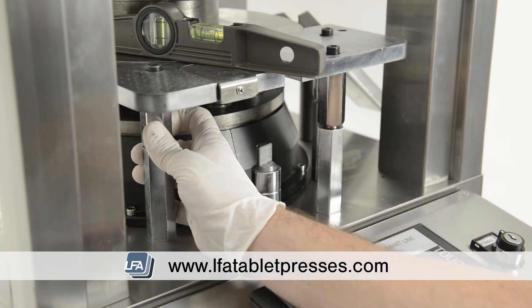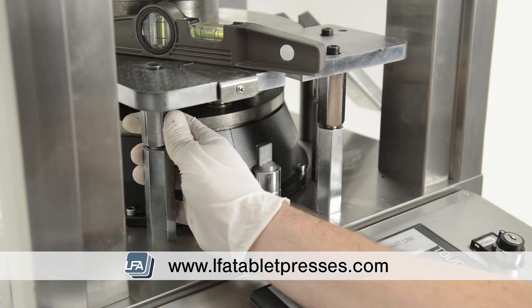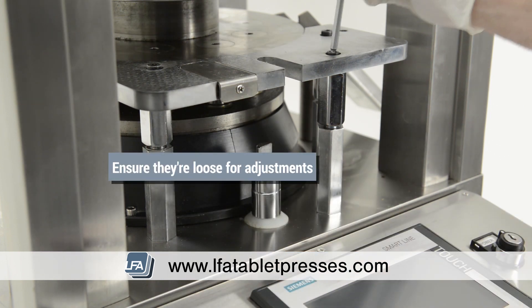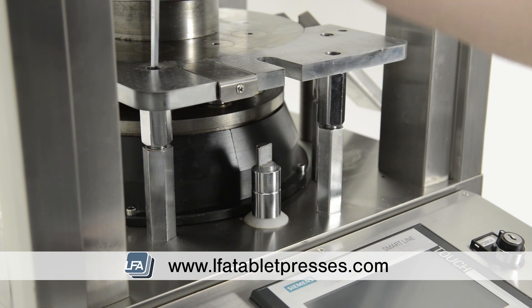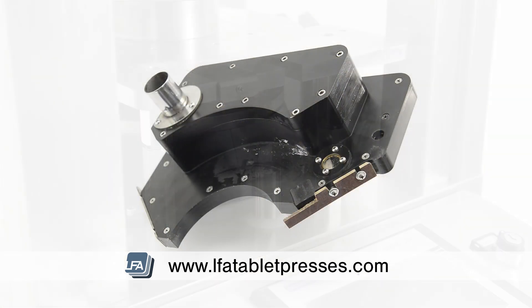Make the adjustments in small increments and look for the gap between the straight edge and the die table. Move the straight edge along the die table and plate to make sure there's no gap down the full length. Once you're happy with those calibrations, tighten the bolts finger tight to allow some final adjustments once the force feeder is in place.